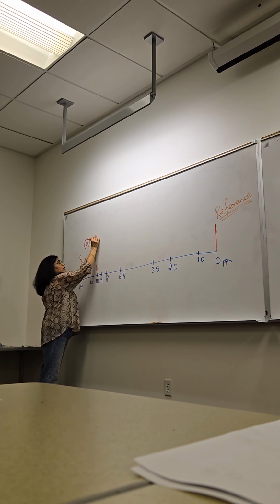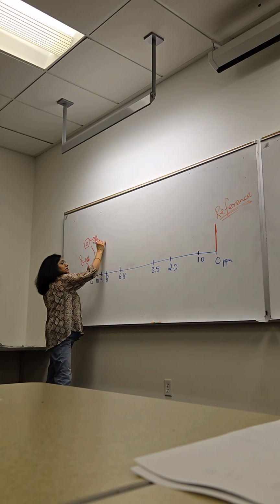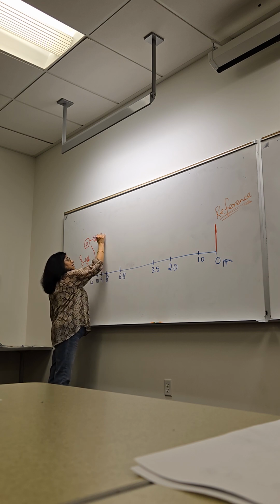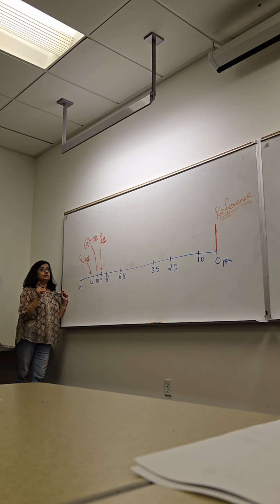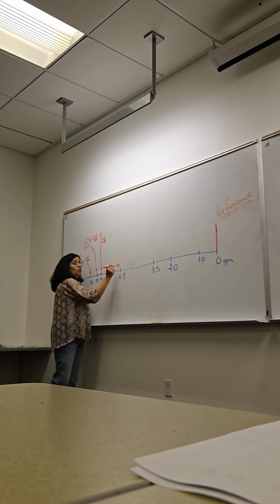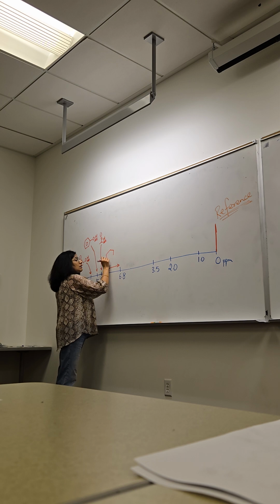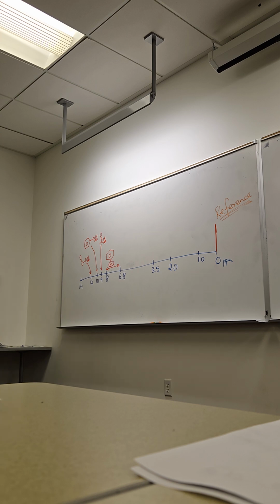10 is similar, but less so, because this is where phenol hydrogens show up. 9, again, very unique, because this is where aldehyde hydrogen shows up. I'm trying to highlight the hydrogen that shows there. Guys with me? 8 to 6.8 is very unique also, because only benzene hydrogens show up here. Depending on how many there are, you'll have signals in that range.